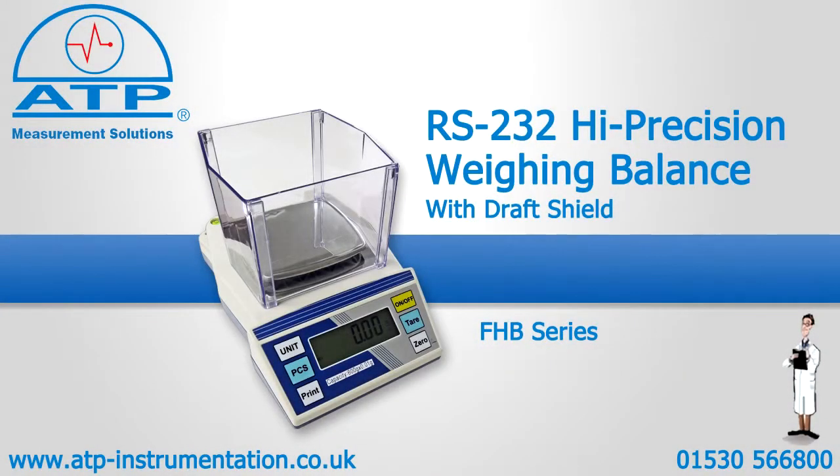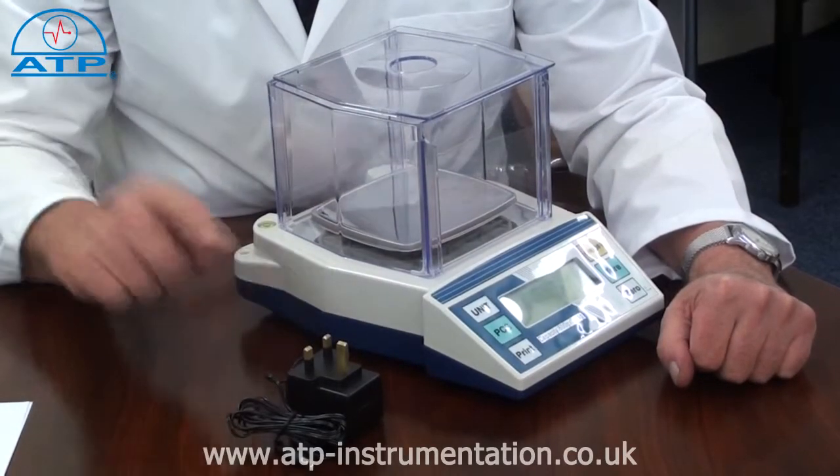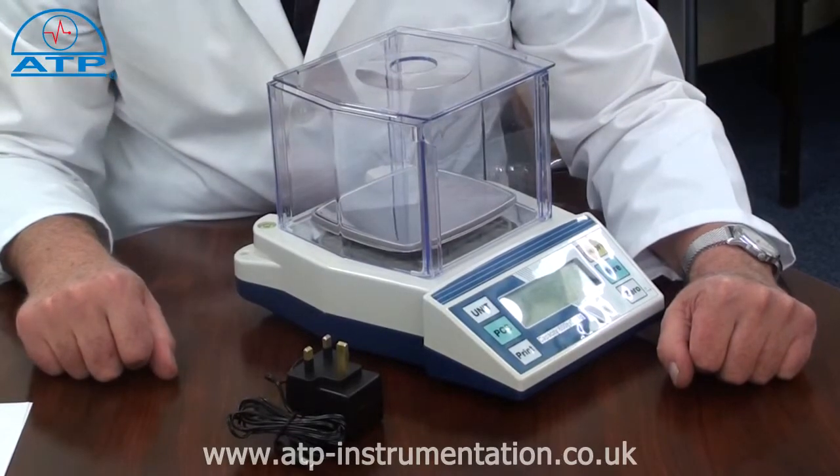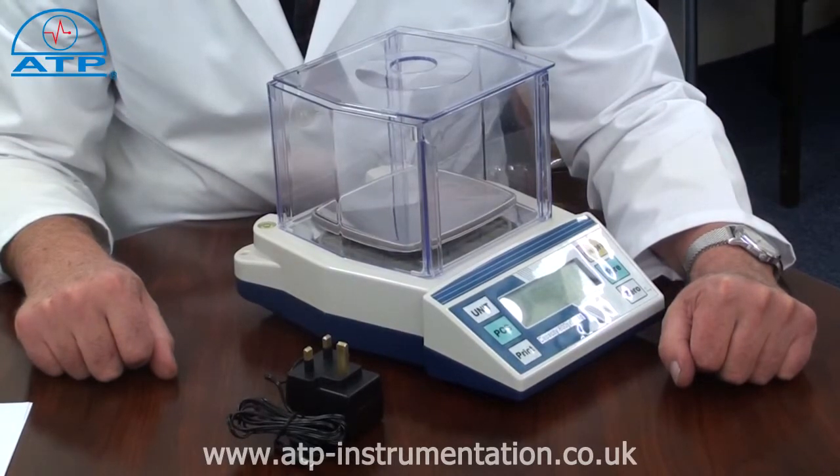An introduction to the FHB portable RS232 parts counting scale. It is supplied with six AA batteries and an AC-DC mains power adapter. There is a featured low battery warning and user selectable auto power off.